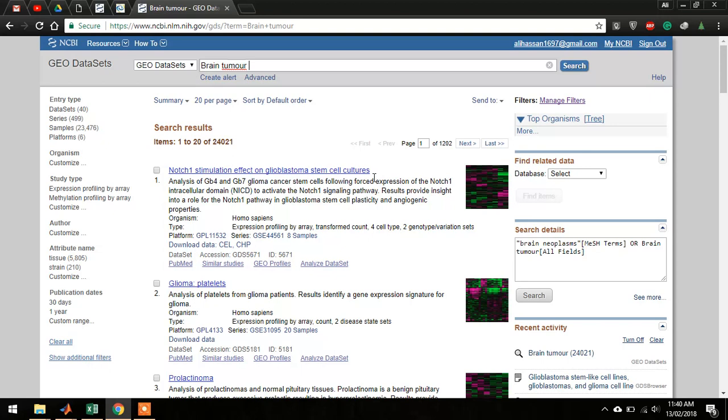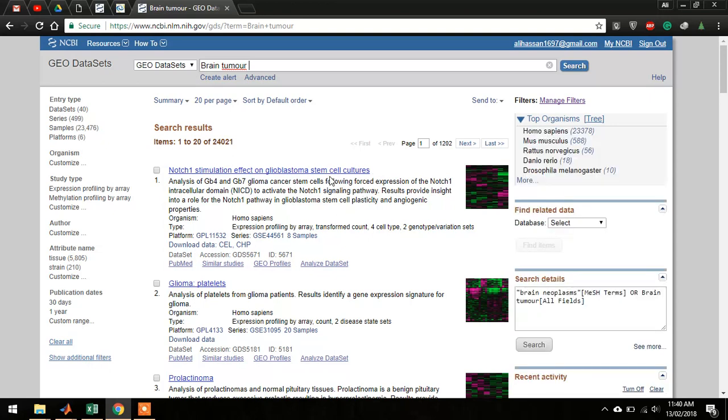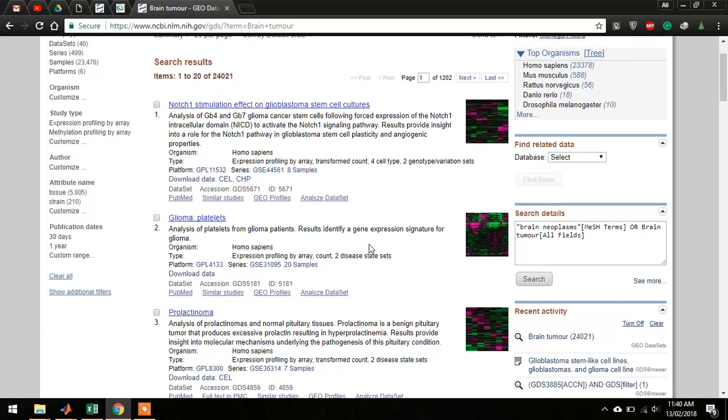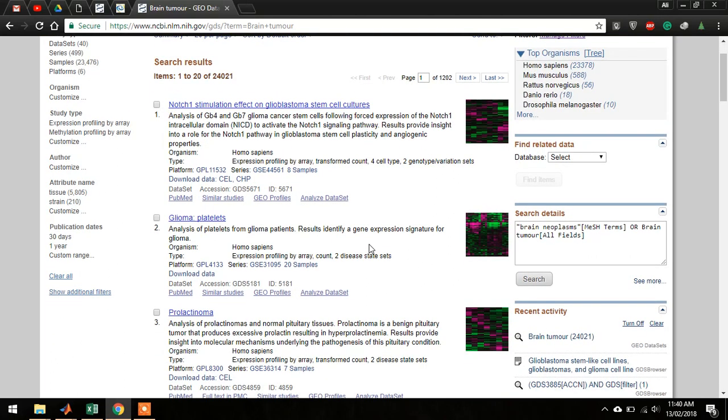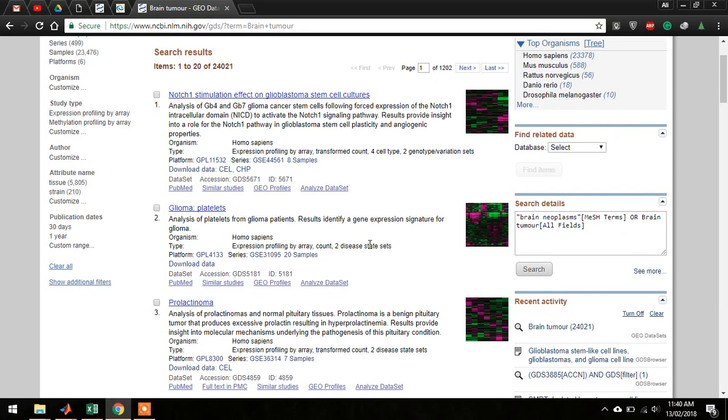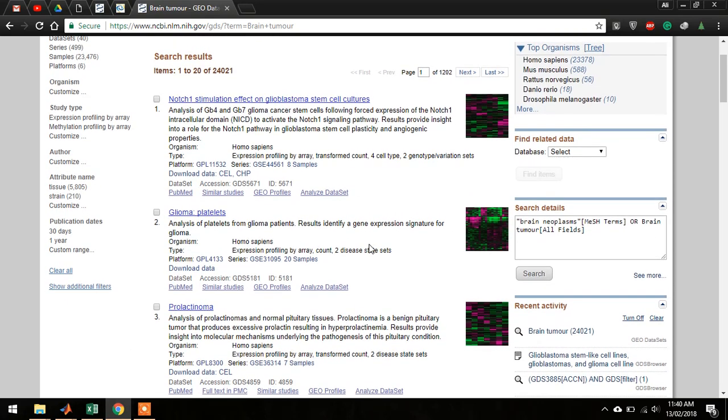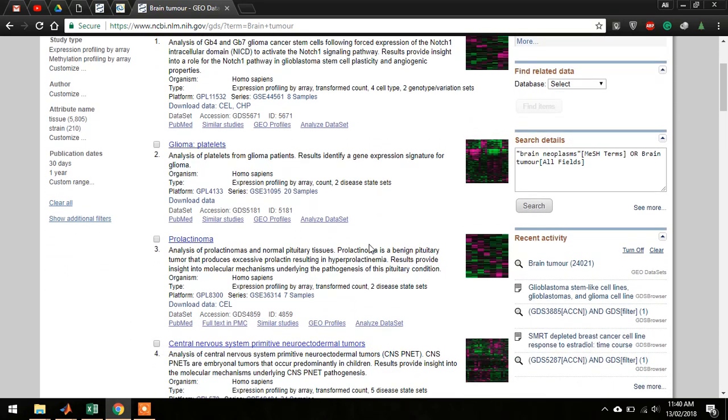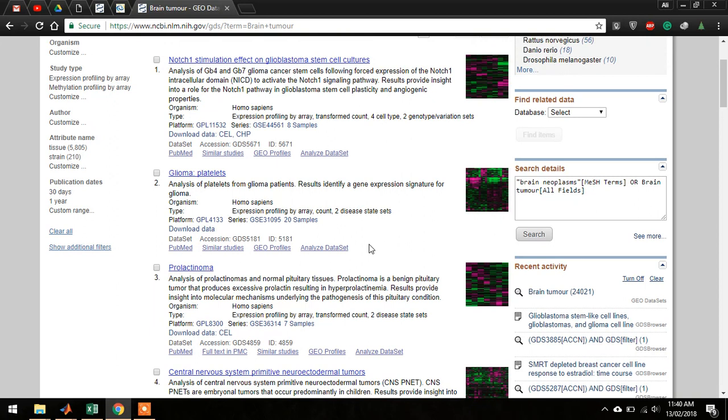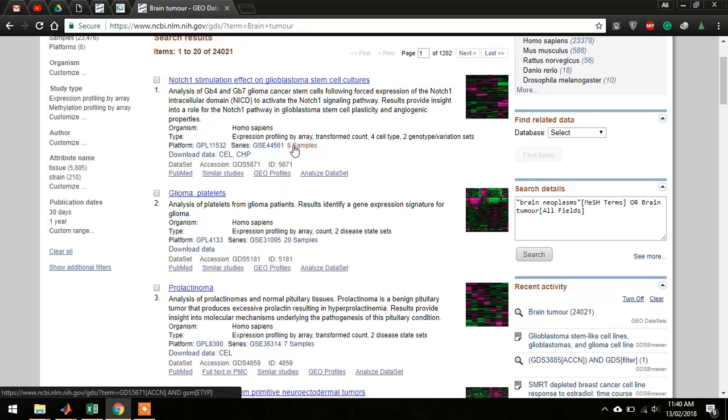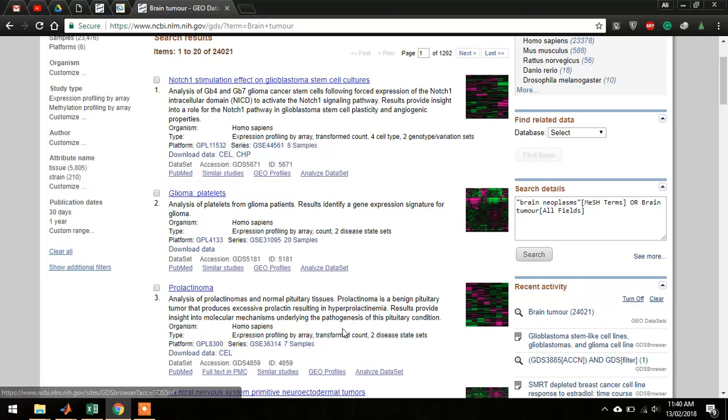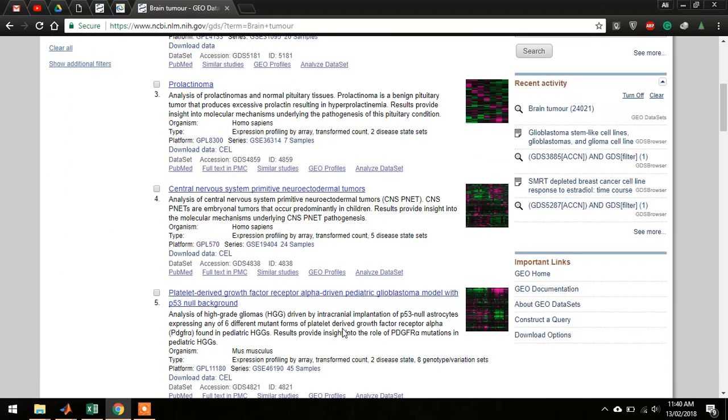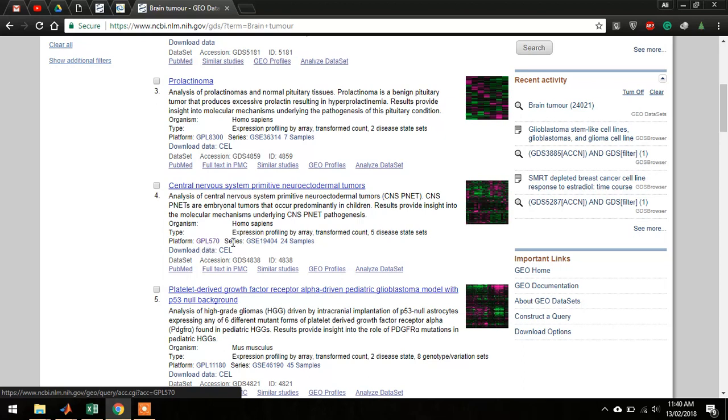Then you have to find an entry with adequate samples, something like 30 or 40 or more is preferred. You need to make sure of two things. First, you have to see that there are enough samples. Then you have to check the platform.